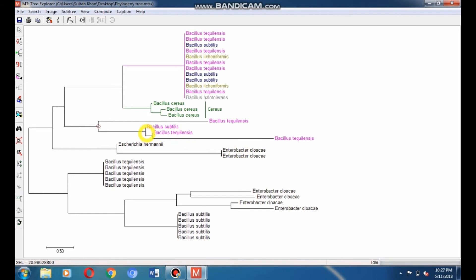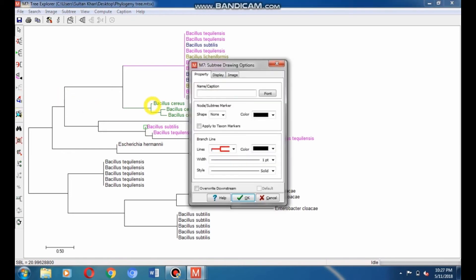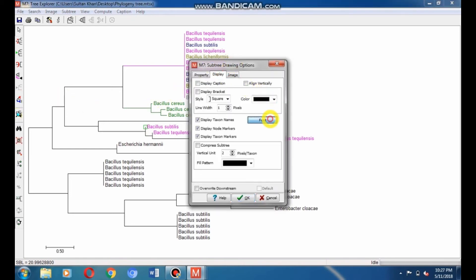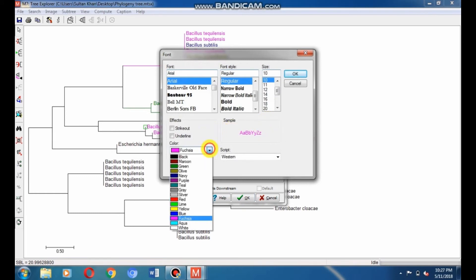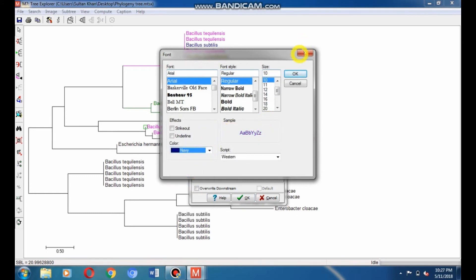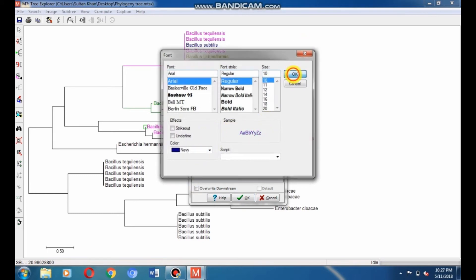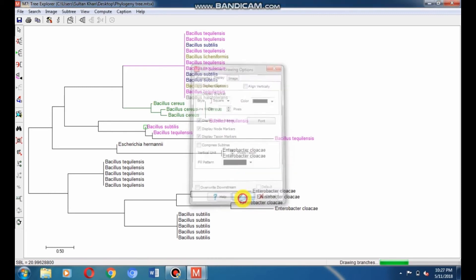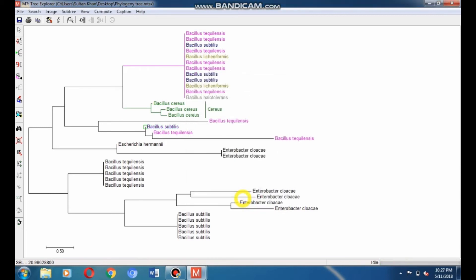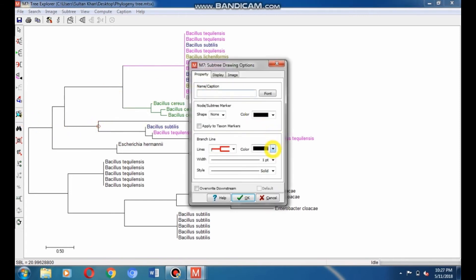Put the cursor in front of the subtilis species. Go to subtree drawing option, go to Display, click on Font, and select navy color, then click OK to apply navy color to the subtilis taxa. Here you can see the navy color subtilis species. Select the branch of Bacillus subtilis, go to subtree drawing option, go to branch, and select fuchsia color. Click OK to apply it.